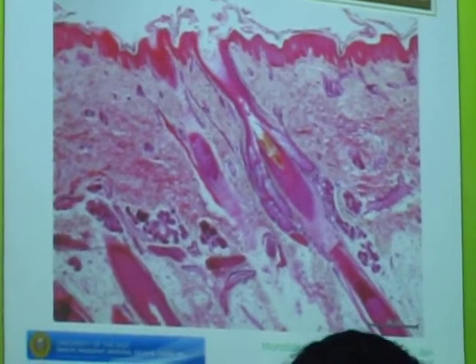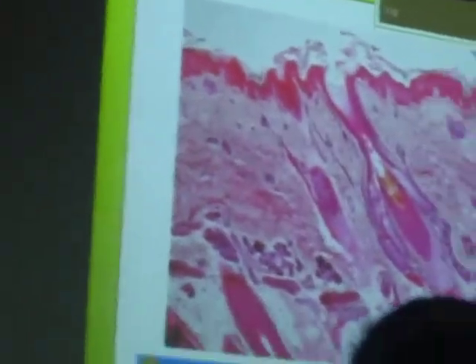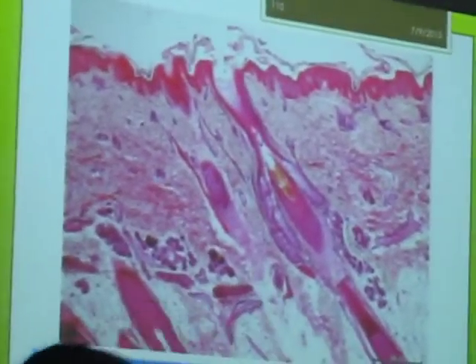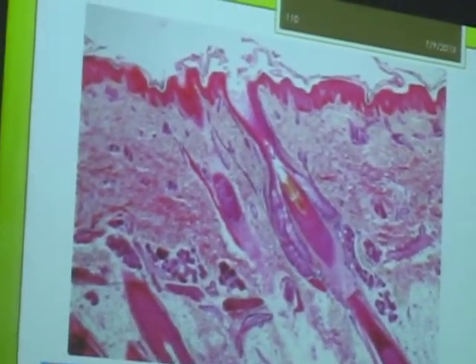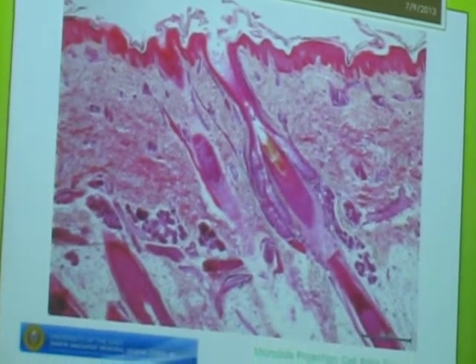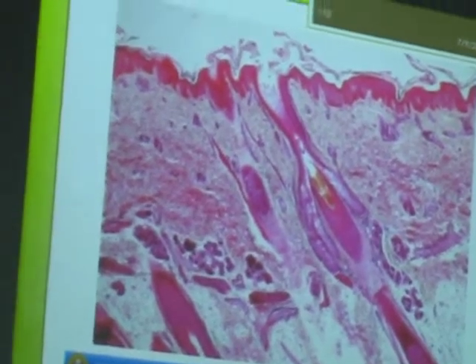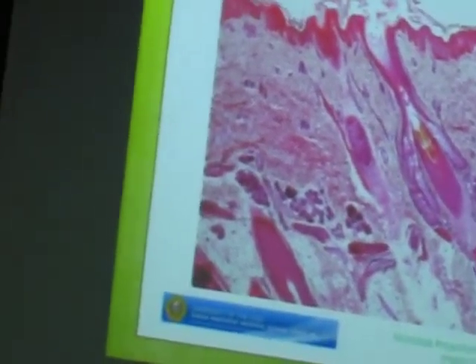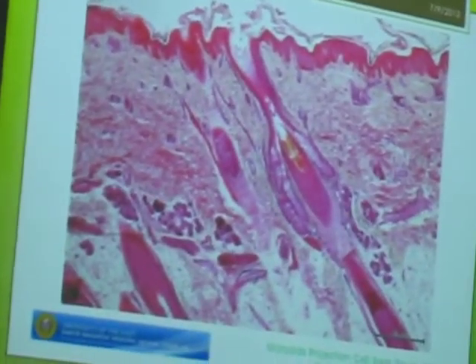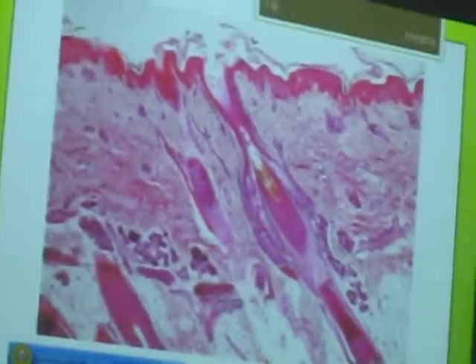Identify the whole organ. Skin. You're almost always sure for this examination in histo. If you are asked to identify the organ, it's just the skin, because you haven't had any other organ yet. This is the skin.